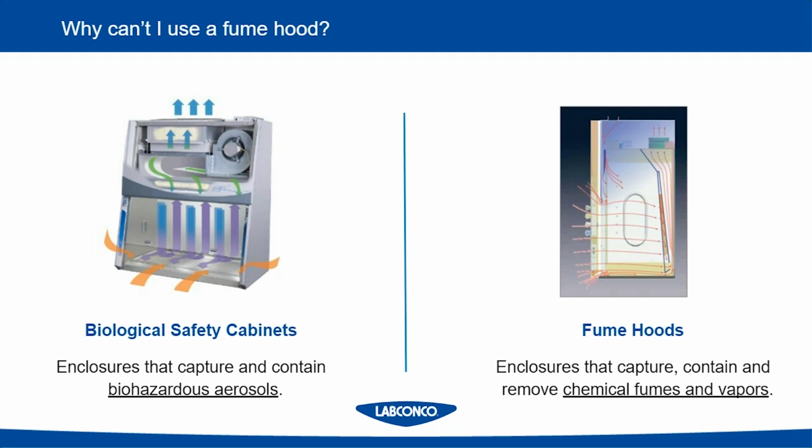And that is, are they trying to trap chemical fumes or vapors, or are they trying to trap some type of aerosol? For biohazards, that could be a virus, a mold, a bacteria, a fungus, anything like that. Any kind of particulate-based hazard is what we would be talking about there.